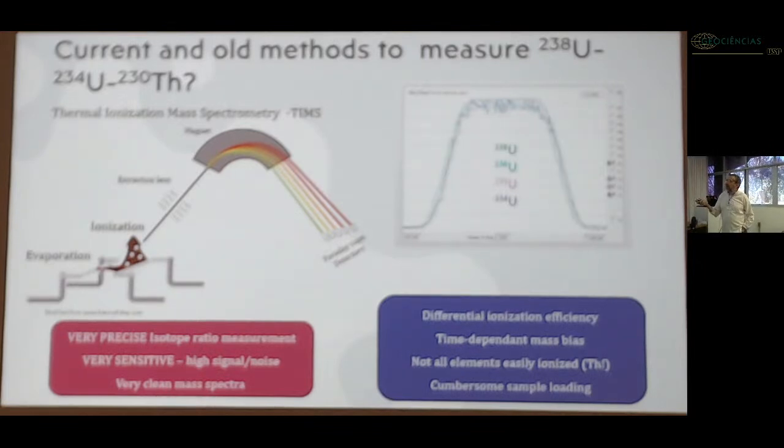because there lies one of the limitations of multi-collector isotope analysis. It comes with a little bit of problems. One of them is what is called differential ionization efficiency. Because you are heating the isotopes here, basically there's a distillation process going on, and it's actually fractionating them. That distillation process, which also happens with oxygen isotopes, is modulated by the Rayleigh equation that you'll discuss later. But it's also time dependent on the analysis.